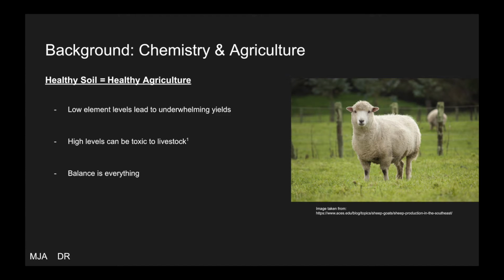Every agricultural venture depends on a solid understanding of chemistry. This is especially true regarding the composition of the local soil, as farmers need to both know the types of elements most abundant in their land and how to change it if necessary. The lack of certain elements such as nitrogen can hamper plant growth, and the overabundance of others such as copper can even kill livestock. In order to develop a knowledge of a particular field or zone, we can use spectroscopy to precisely analyze soil composition.